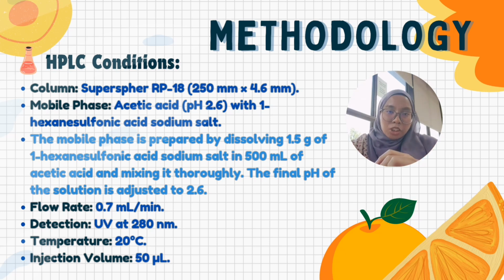For the detection, we have to use a UV detector and set a wavelength of 280 nanometers to monitor the effluent. And to confirm, the retention time for ascorbic acid is around 4 minutes.